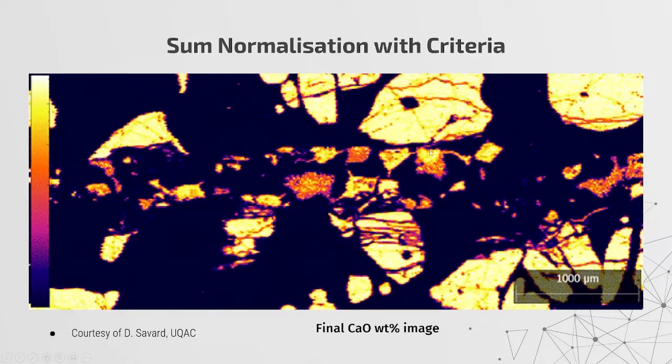But when we calculate our final calcium concentration image, we can see that they're actually quite the same, and that's what we'd expect using stoichiometry. One's about 55% calcium, the other one is about 56. So this is actually what the values should be.